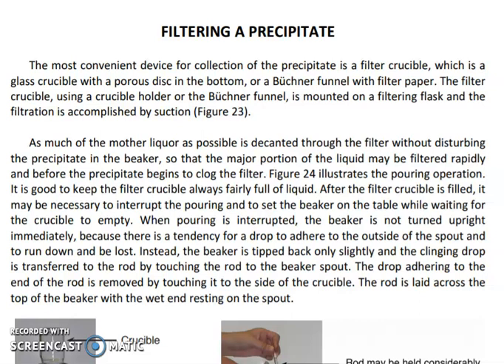Today in this video, I am going to present how to filter a precipitate. So let us start.